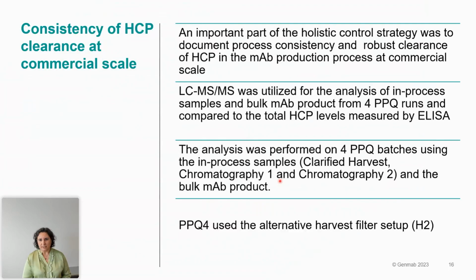So in this case, we use LC-MS again, but we also compare to ELISA results on 4 PPQ runs. Again, we analyzed the 4 PPQ runs using the in-process samples: clarified harvest, chromatography 1, chromatography 2, and at the end the drug substance or bulk product. With the caveat that PPQ4 was the one that used the alternative filter setup.